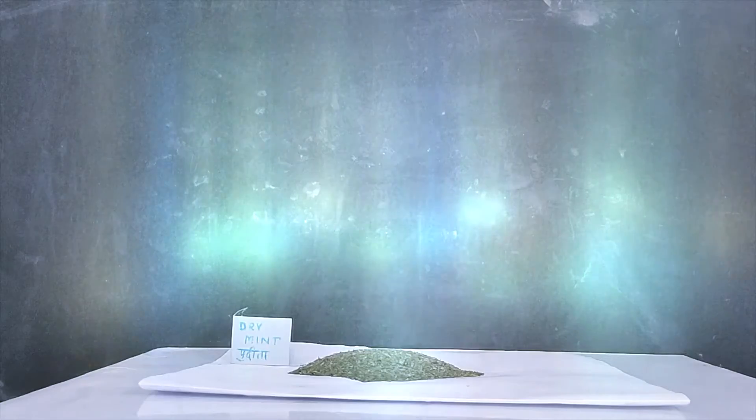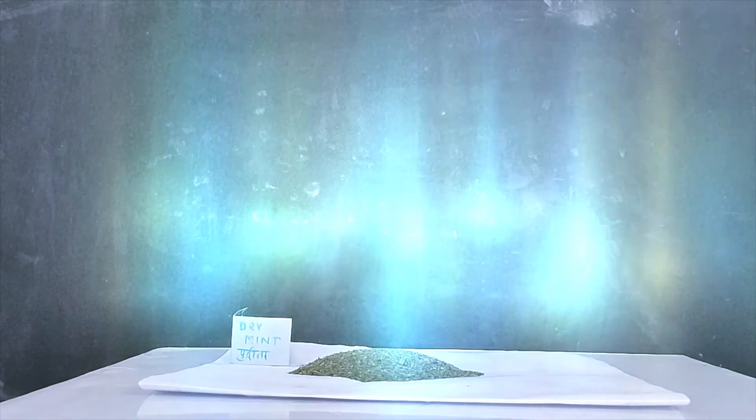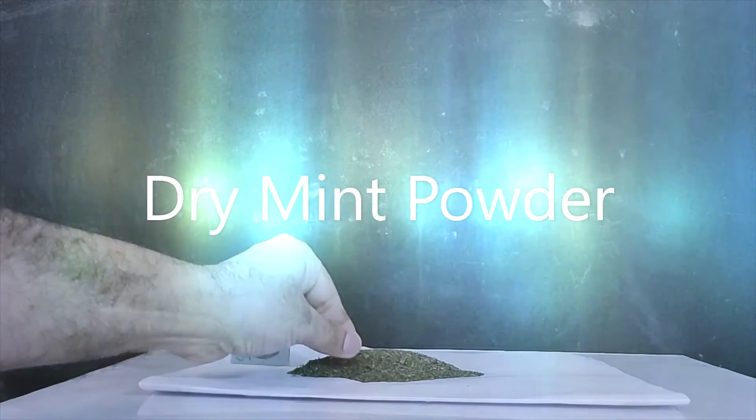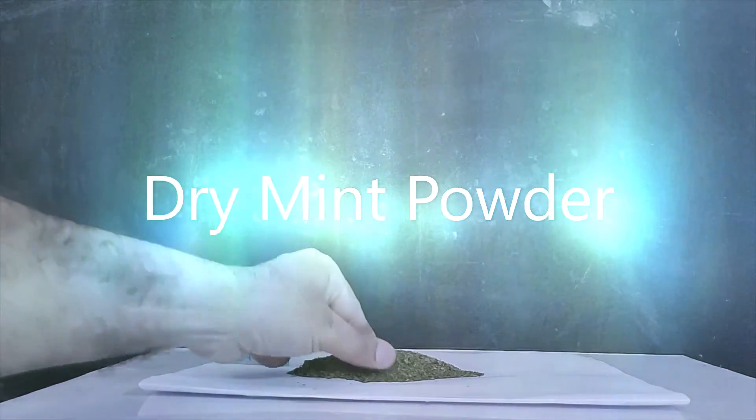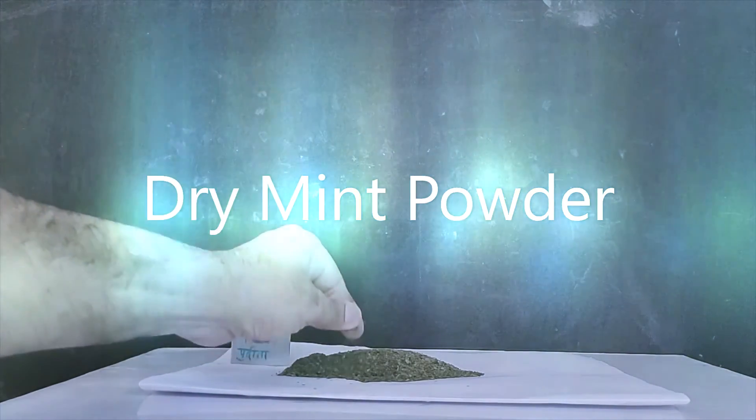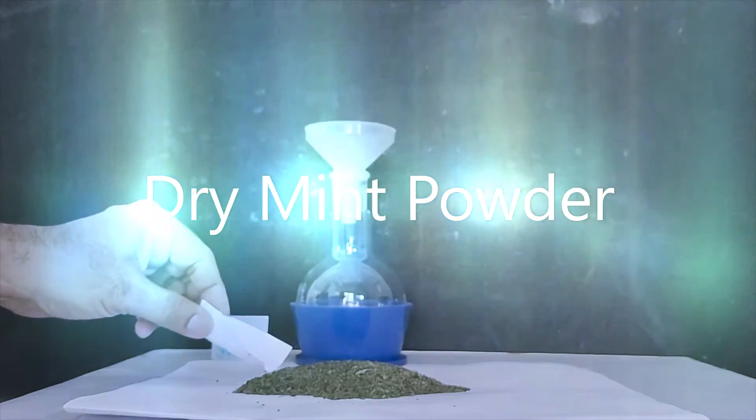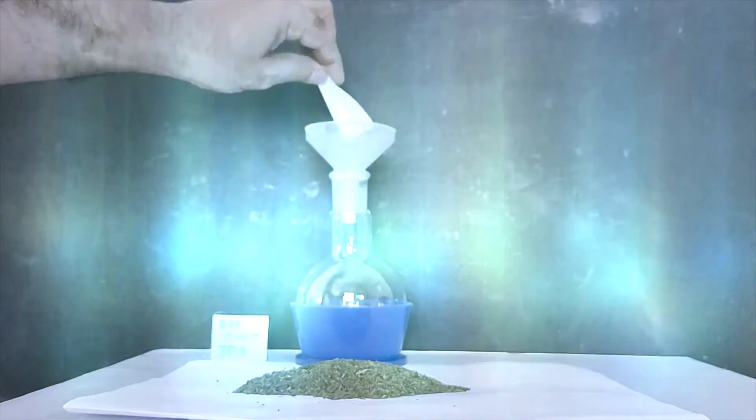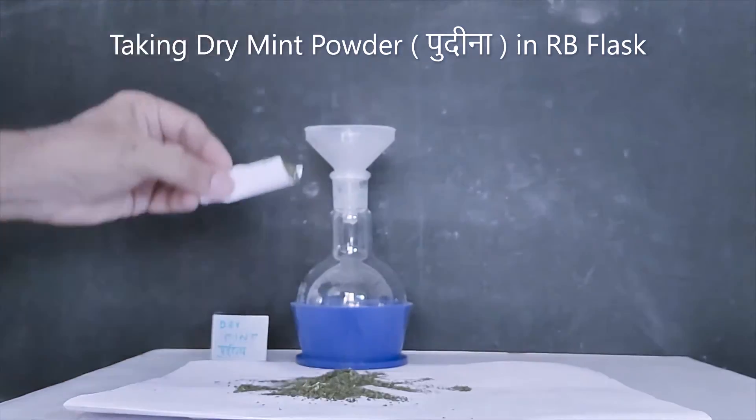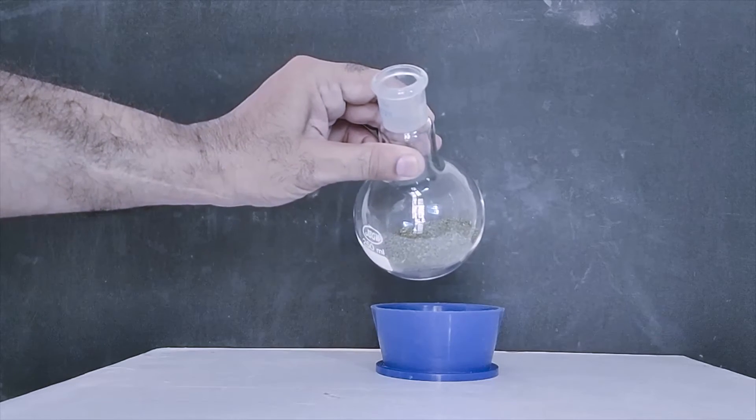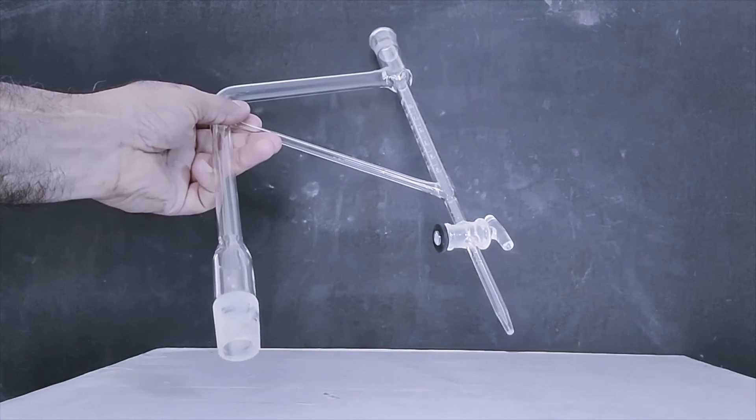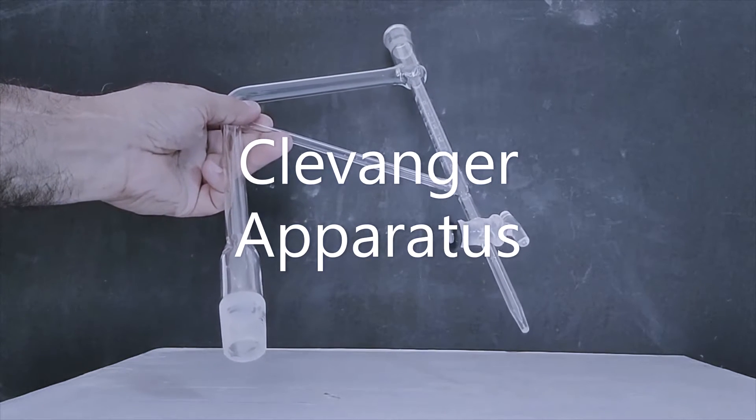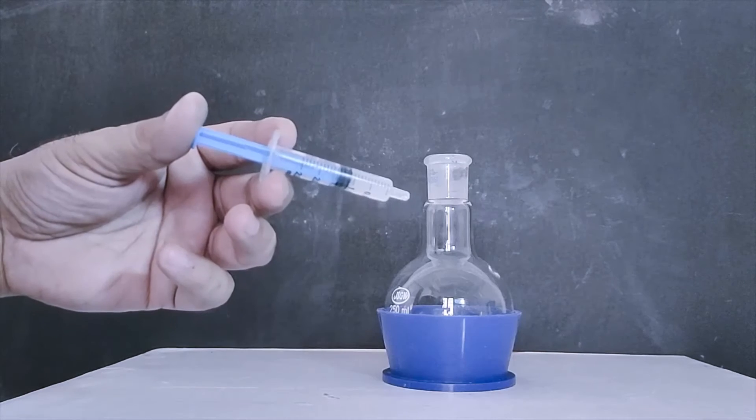Extraction of essential oil using Clevenger apparatus. Dry mint has a good smell. Taking dry mint powder into round bottom flask. Clevenger apparatus used for extraction of essential oil. Vacuum grease.